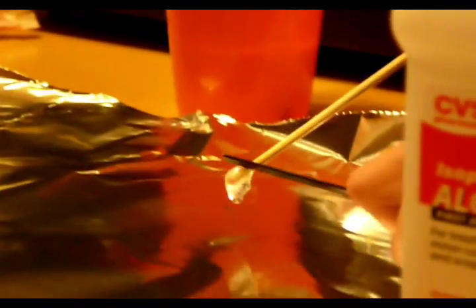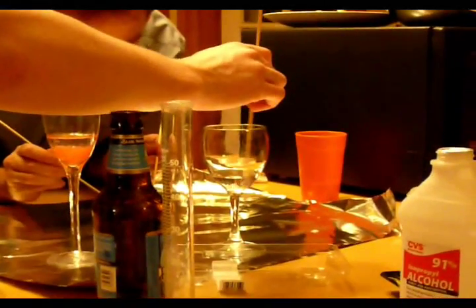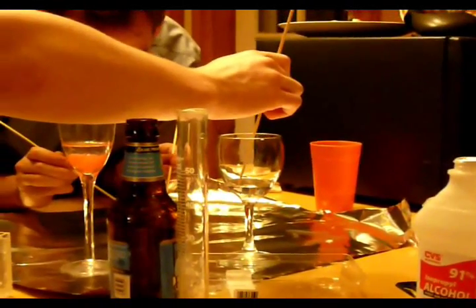Oh, my God. Eww. Eww. That's smart — scrape it off. Lost your DNA in the alcohol. That was really married.